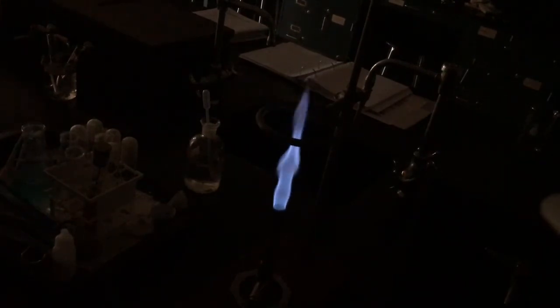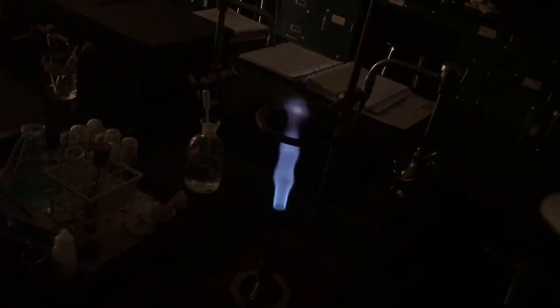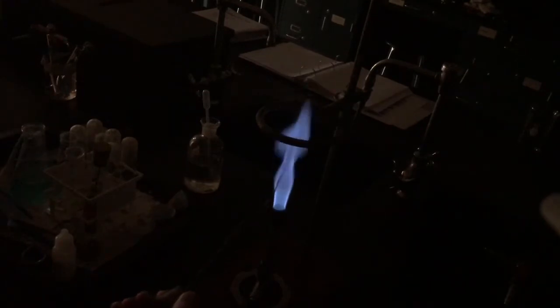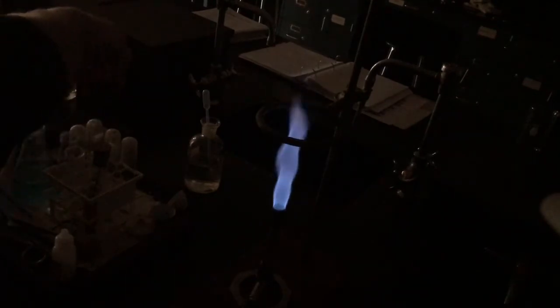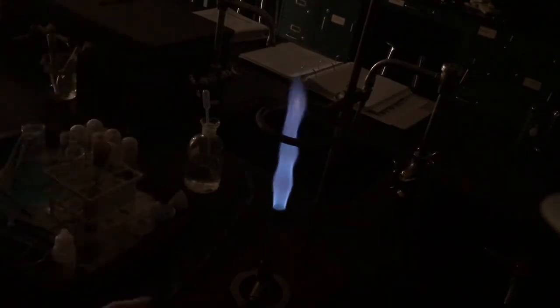So what we're going to do is take a nichrome wire and heat it up, and then dip it in some hydrochloric acid to clean the tip of it, like that.